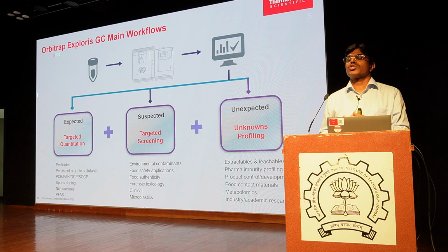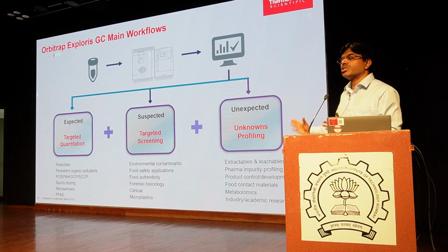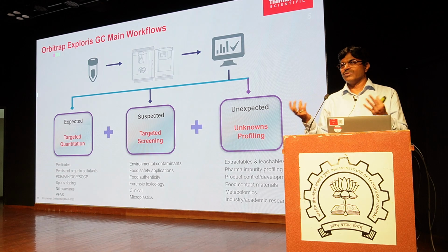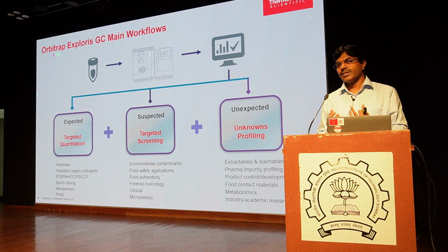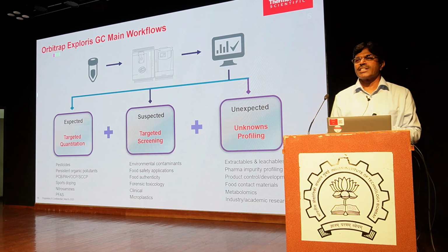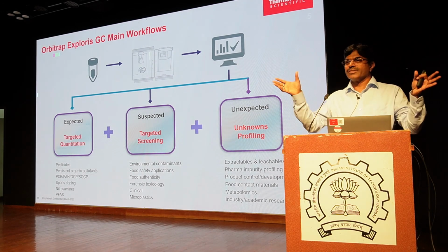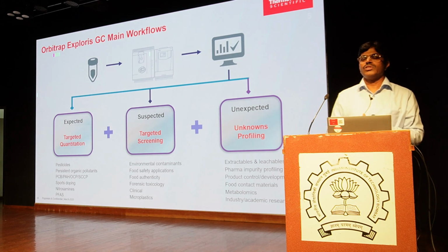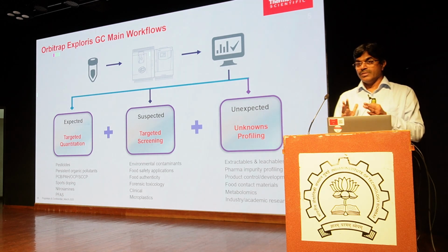In Europe, most of these labs do the total profiling because they get samples from all over the world, like foodstuff they import. And they want to ensure that the food is safe. This is just one example that I'm giving. So they screen completely, known and unknown, and then ensure that the food is safe. We are not doing it.